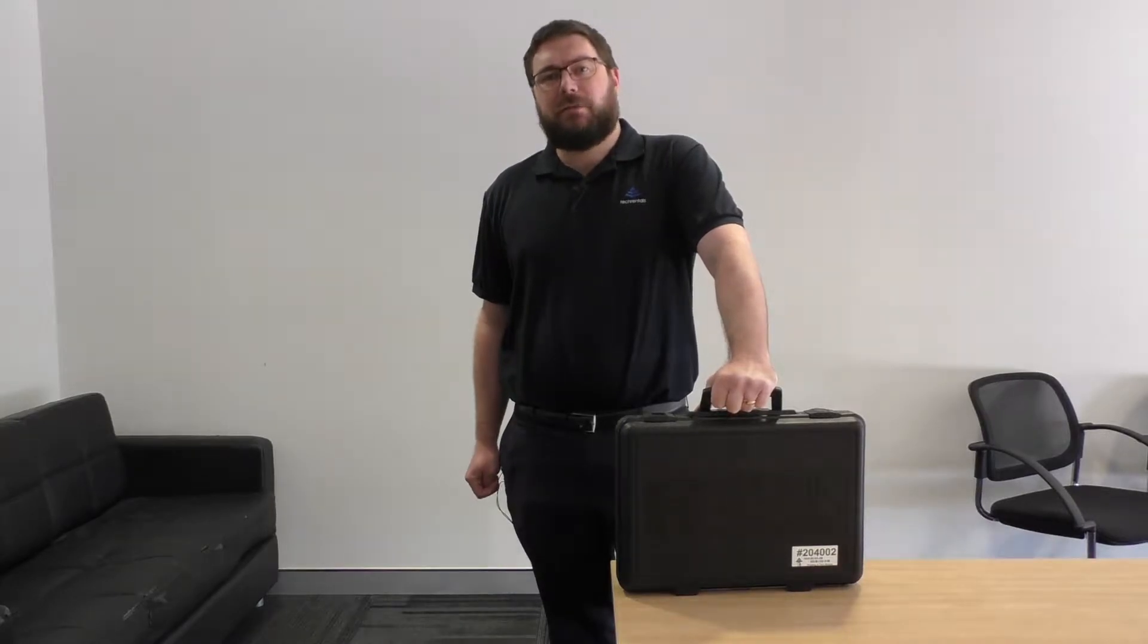G'day, this is Nathaniel Brewer, Product Manager here at Tech Rentals. Today we're going to be talking about the HANA 98194 water quality meter.